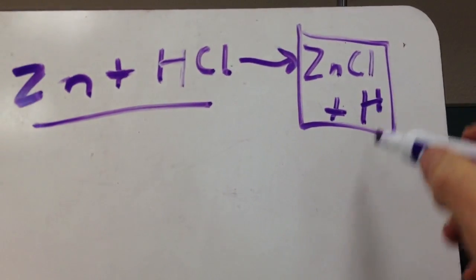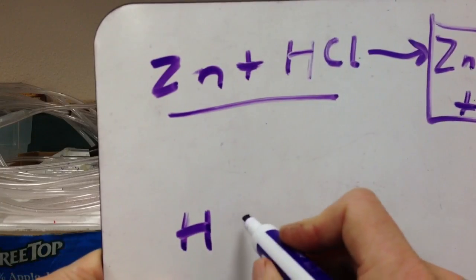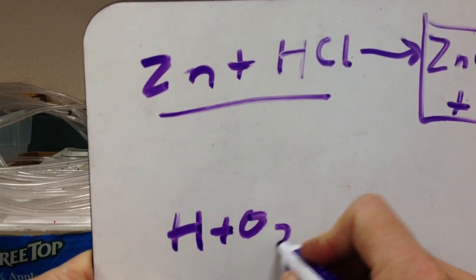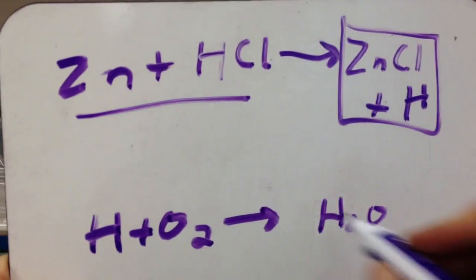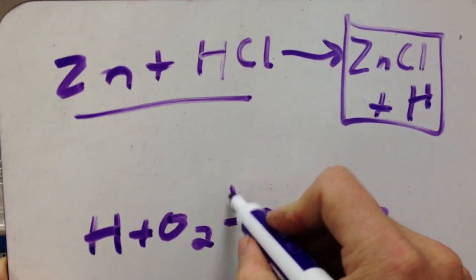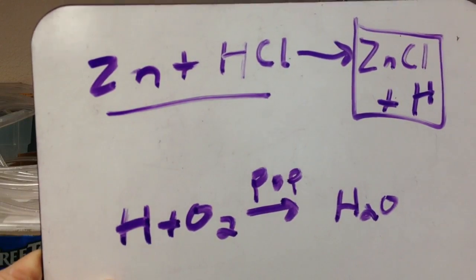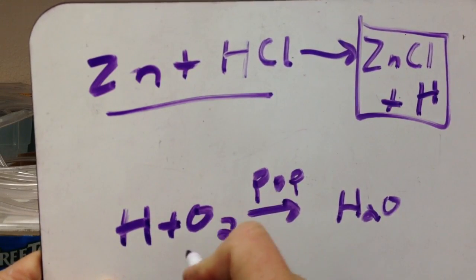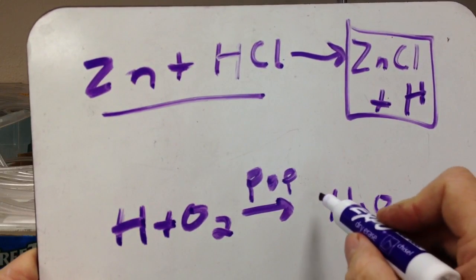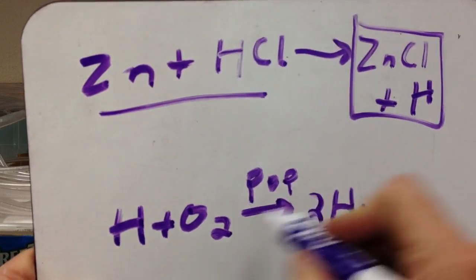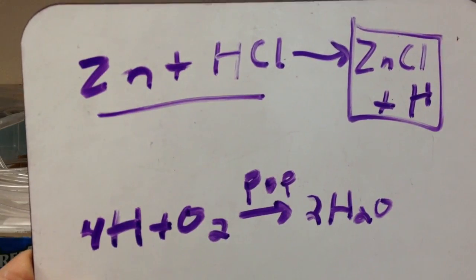Now, the other cool thing we did is we captured that hydrogen gas. So, we did two reactions. We took the hydrogen, we added oxygen to it, and we created water. This is the part that was done in the test tube where you heard the pop or the bang, because we're basically blowing up the hydrogen. When that happens, it reacts with oxygen to make water. This isn't exactly balanced, so it would take, to make two waters, I would need four hydrogens. There we go. Thanks for watchin'.